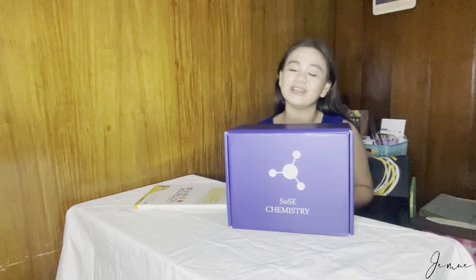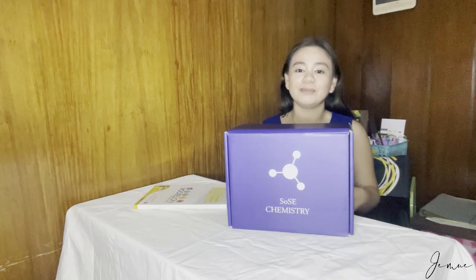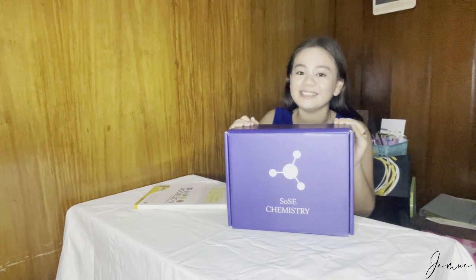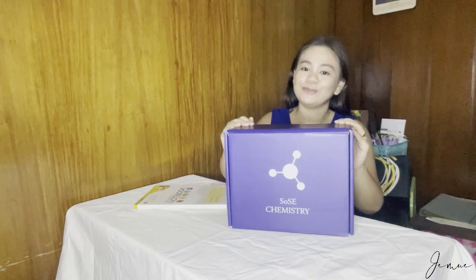I am taking BS Health Sciences. For today's video, guys, mag-a-unboxing tayo ng aming chemistry lab kit at home. Pinadala to sa akin ng school kanina lang, and I'm super duper excited to open it. Let's get started!